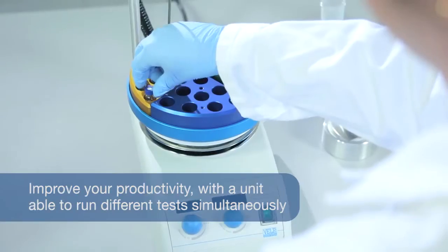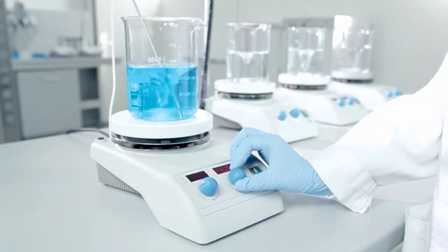Aerex Digital — destined to be used in so many different places, in so many different ways, with remarkable results.